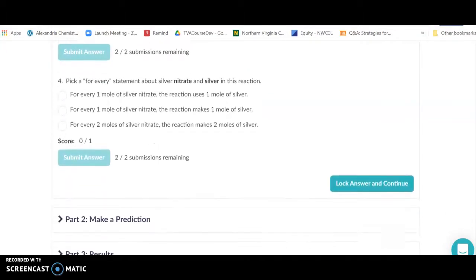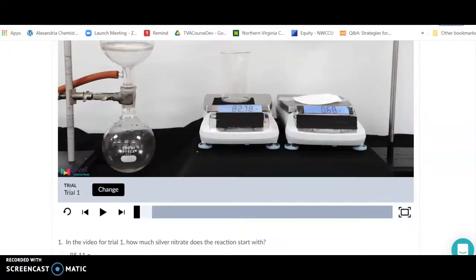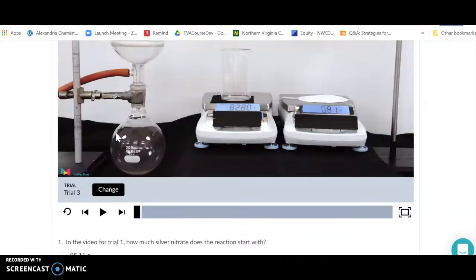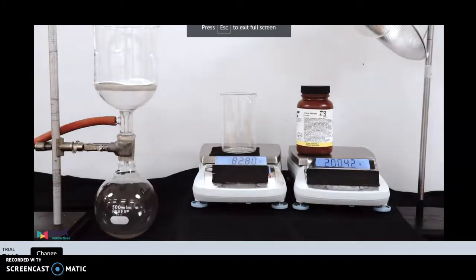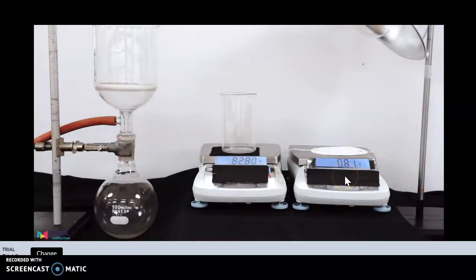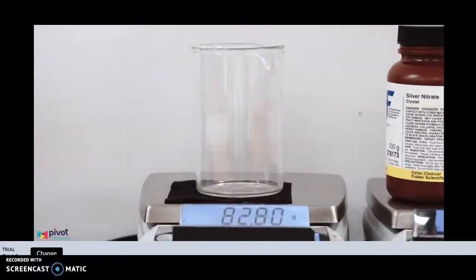You're going to start by answering questions on the amount of silver nitrate, then lock your answer and make a prediction. I'm going to run through trial number three — you won't be doing trial three for your experiment. You'll need to take screenshots as you go. Hit play first, and the first thing to note is there's a piece of filter paper on the far right at 0.81 grams — make sure you record that, because that's our starting point.